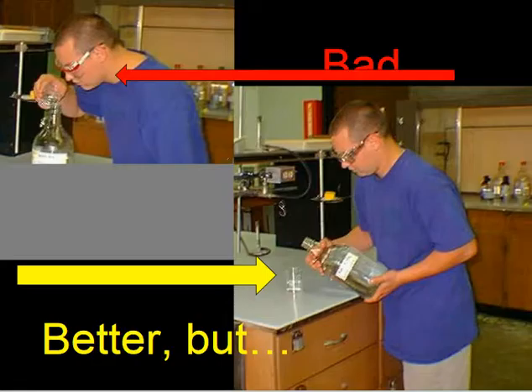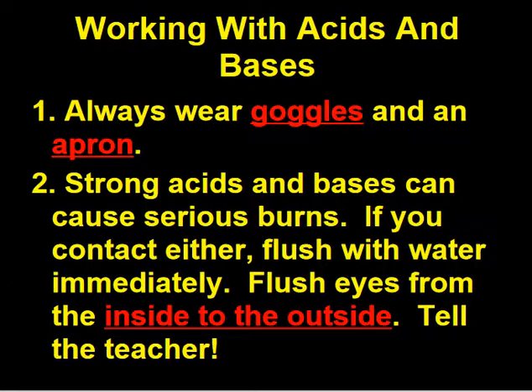Now here's a good way and a bad way to add water and acid. The bad way is to add water to the acid, because if you do that, sometimes it splatters, and if you add water to a large amount of acid, the acid will splatter up on you. But if you have a small amount of water and you add acid to the water, what splatters? The water splatters.